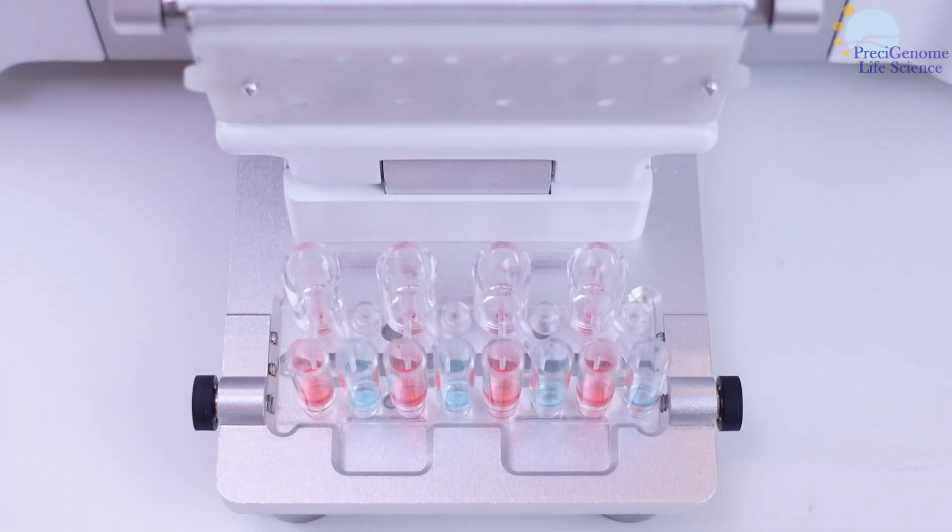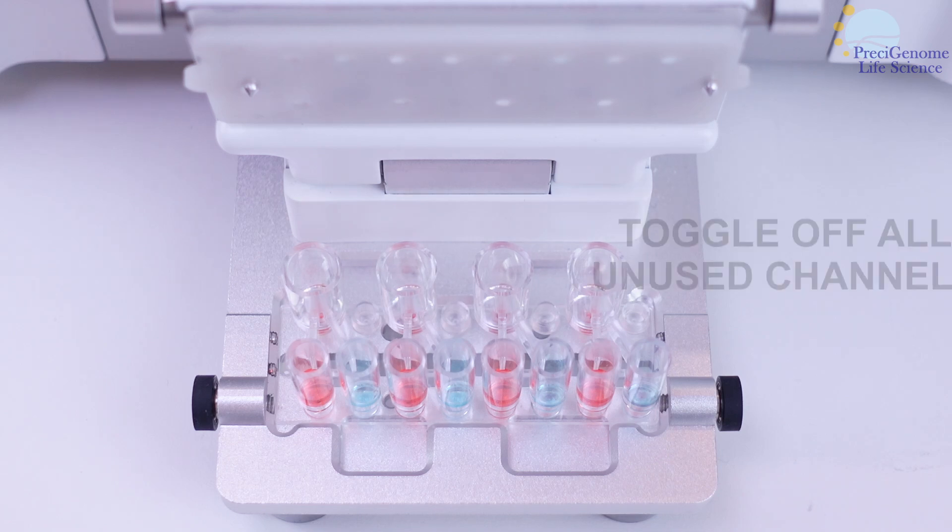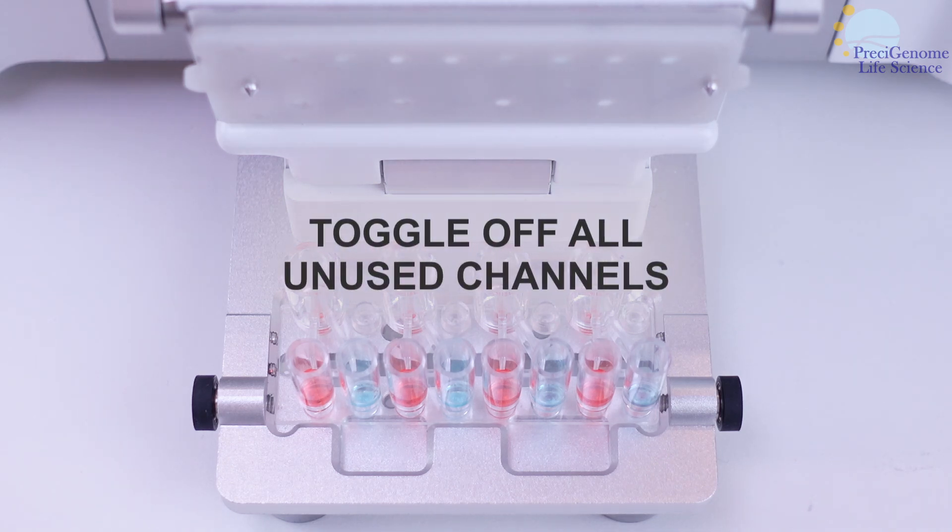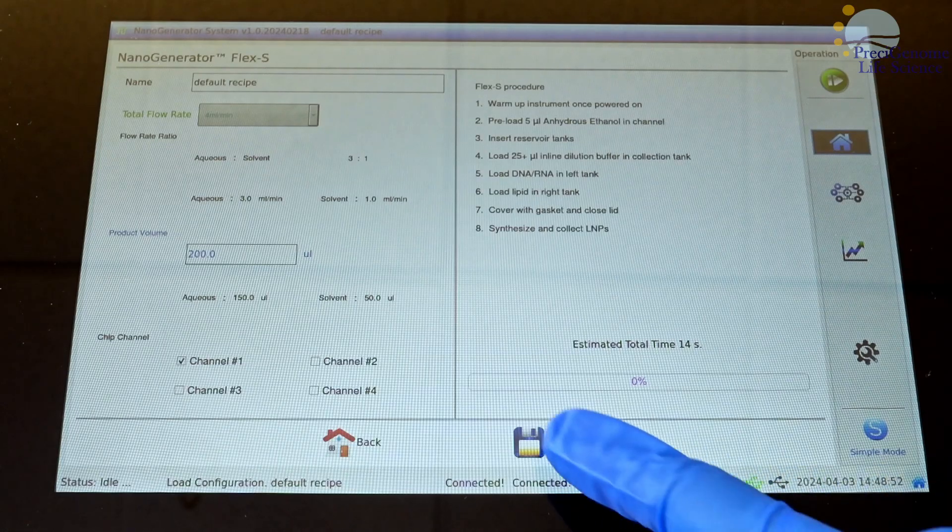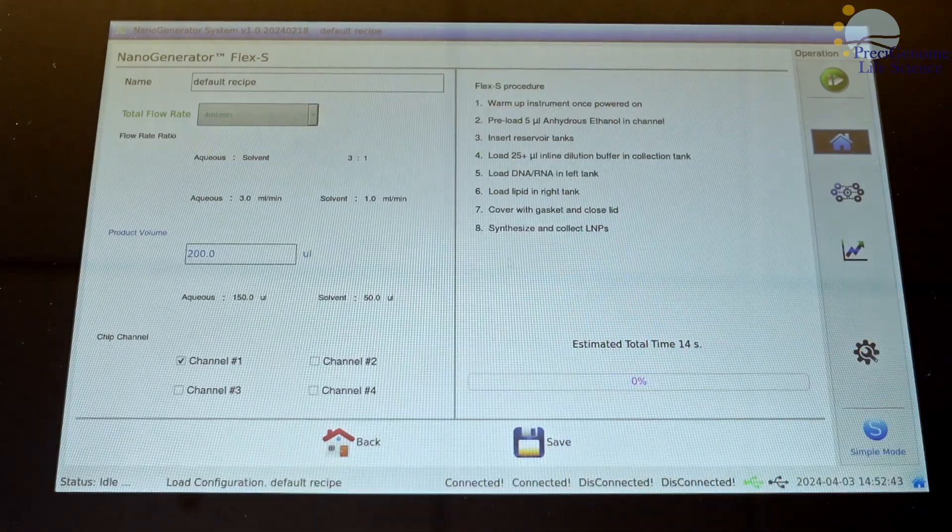While up to 4 channels may be used at once, keep all unused channels off to prevent air leakage. When you are done setting your parameters, simply save the recipe and it is ready to go.